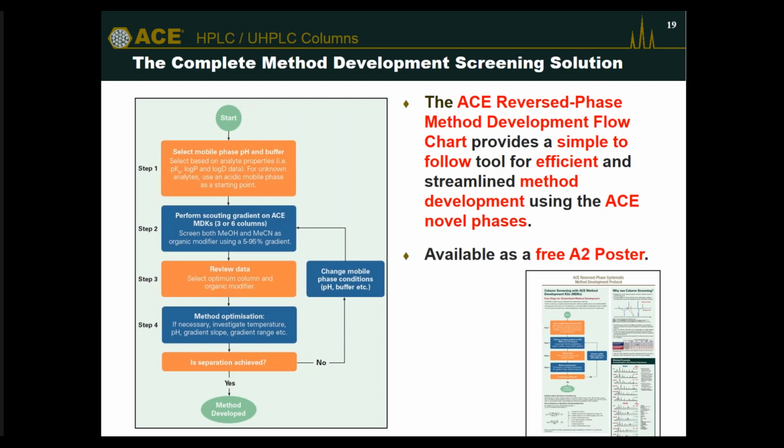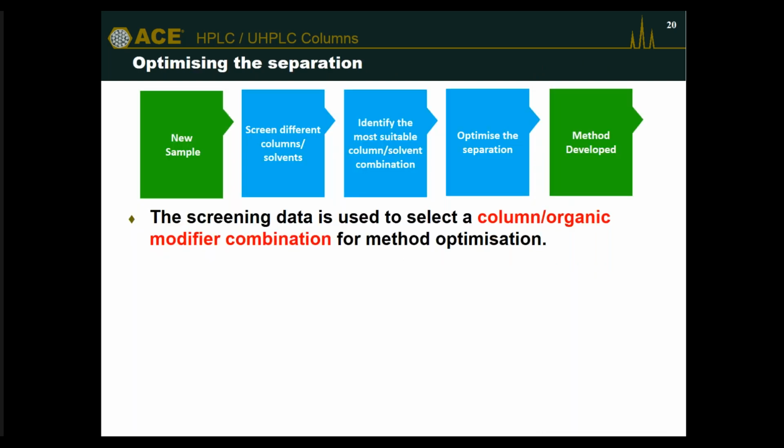So to the second part of the talk now. So the first part I talked about chemistries and solvents and how screening is useful, and we were fortunate enough to have options where we had complete separation for the paracetamol application. So what about complex applications where you don't get options from the screening data? So what about if we need to further optimize the separation?